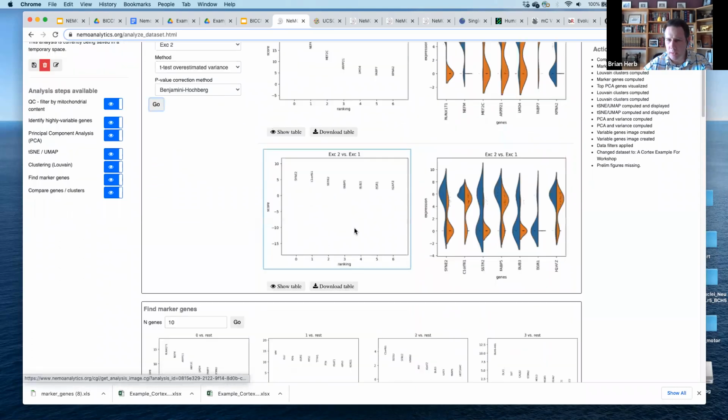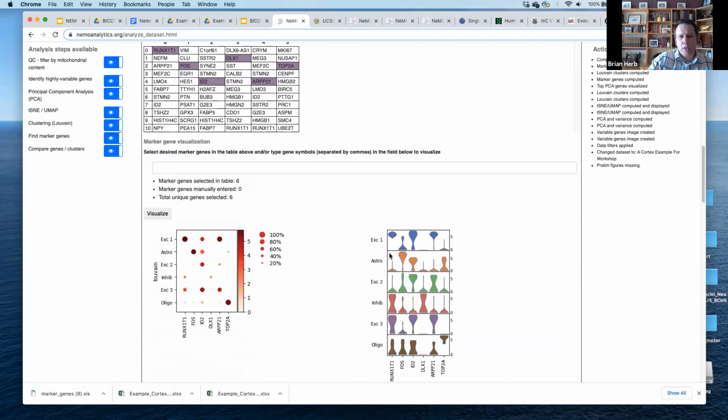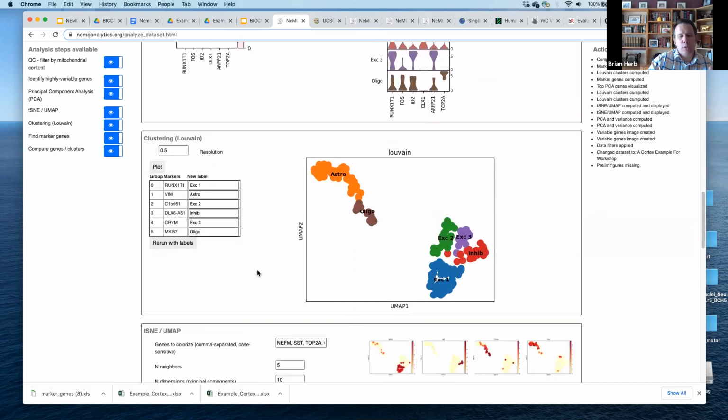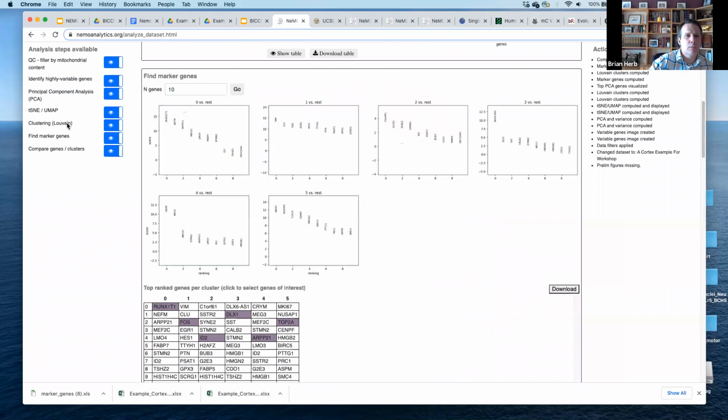By the way, if you have a data set that you already have analyzed, so you've uploaded a data set, so you already know what the cell type is, what the t-SNE coordinates are, you can actually start the single cell workbench from this step. So notice that everything we've done up to this point was identifying clusters, identifying cell types.